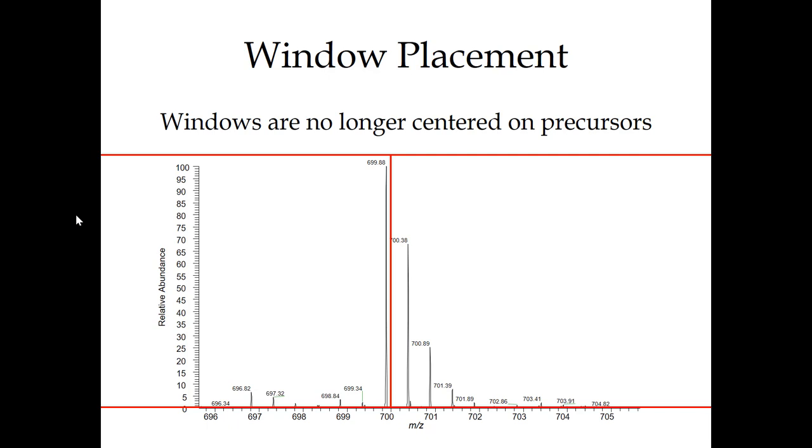So there's a couple ways around this problem. The one I'm going to show you is just saying, well, I'm going to try to optimize where these edges are to avoid this case. The other way to do it is just to add some slop. So just to put margins on the window, which is going to say, well, I'm going to let these windows overlap a little bit, so I'm going to make this window come out to here and this other one come out to here.